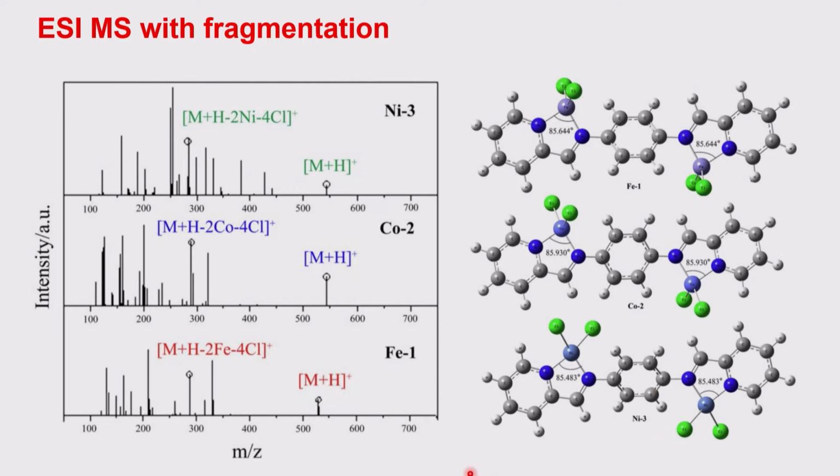And now if you look at this and expand, you will find the isotopic peak distribution, and you can say this particular thing is coming from the nickel only, this is coming from cobalt only, this is coming from iron, and there is no way that you get confused between them if you look at the isotopic peak pattern of each of these. And that is not shown here, because the idea of this particular slide is just to show the fragmentation aspect through this example.